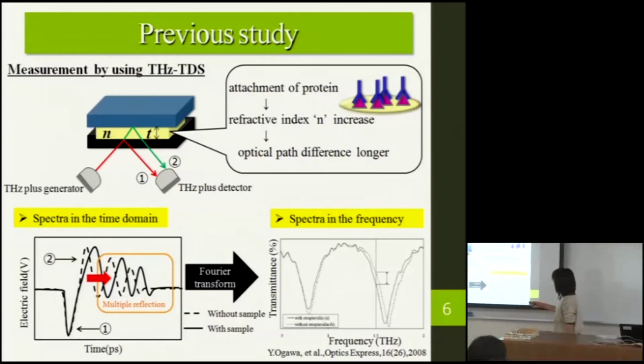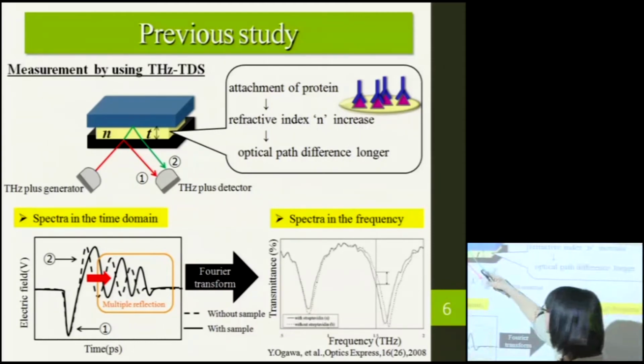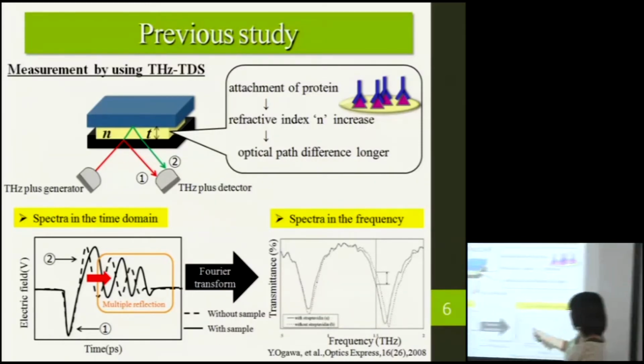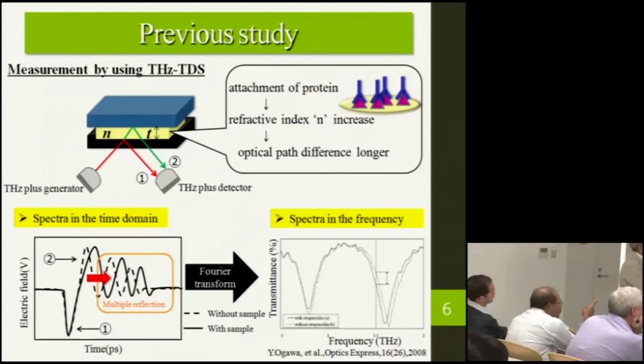In fact, we detected reflected light, but this second reflected light considers the membrane filter and reflected mirror. So in fact, we get the information in this membrane filter. Although we detected the reflected light, I showed transmittance in this research. So the green line is transmitted through the sample and 100% reflected by silicon. That's silicon, the blue one.